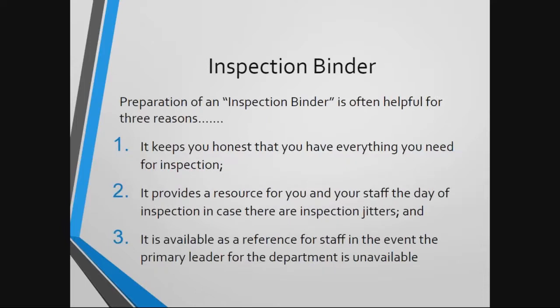So years ago, I was introduced to the concept of an inspection binder. While at the time, it seemed like a whole lot of unnecessary work, I grew accustomed to the idea and now completely endorse the concept because I have seen many times where it has been invaluable. I have since developed an electronic version of this for my departments, but the concept is still the same.